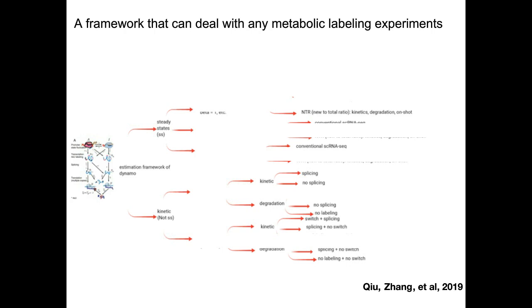So essentially we built a universal estimation framework in our tool. This framework uses two different assumptions: the steady state assumption, and the kinetic assumption without assuming steady state. For the steady state assumption, we have three different models: linear regression, generalized method of moments, or a negative binomial distribution-based approach.